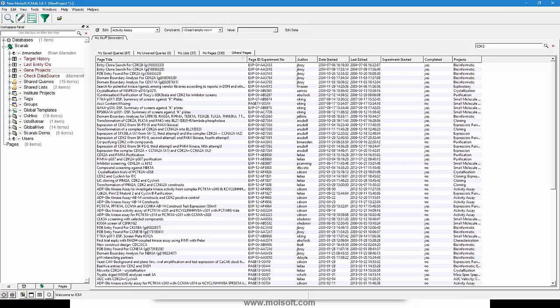Yeah, I think maybe the person who was asking this question was perhaps thinking about the idea of being able to be in ChemDraw and copy and paste into here. Yeah. That works if ChemDraw exports the actual image itself, but the actual embedding of the SDF in an integrated way doesn't work in that way yet.